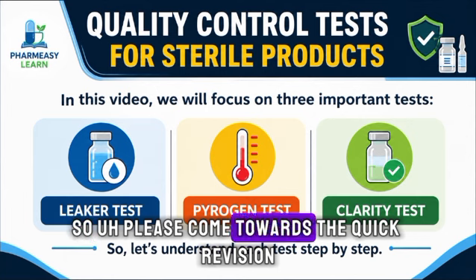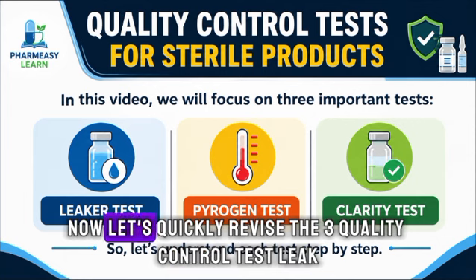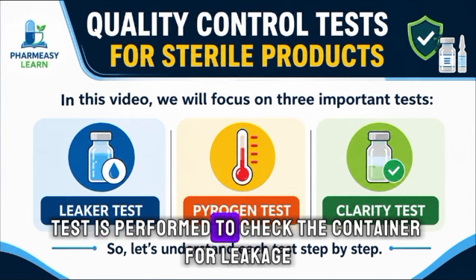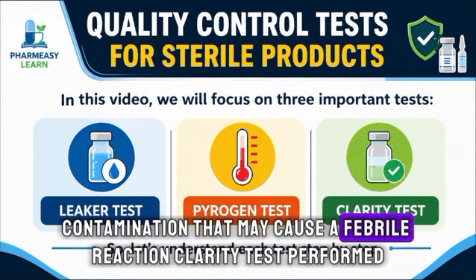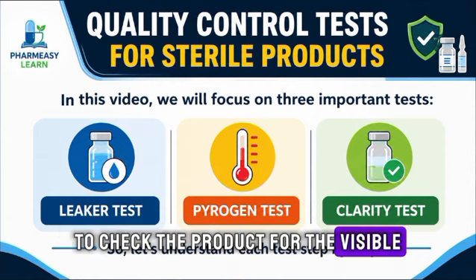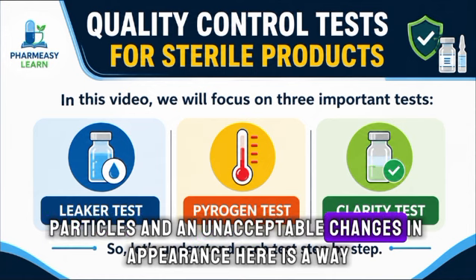So please come towards the quick revision. Now let's quickly revise the three quality control tests. The leaker test is performed to check the container for leakage and closure defects. The pyrogen test is performed to evaluate pyrogenic contamination that may cause a febrile reaction. The clarity test is performed to check the product for visible particles and unacceptable changes in appearance.